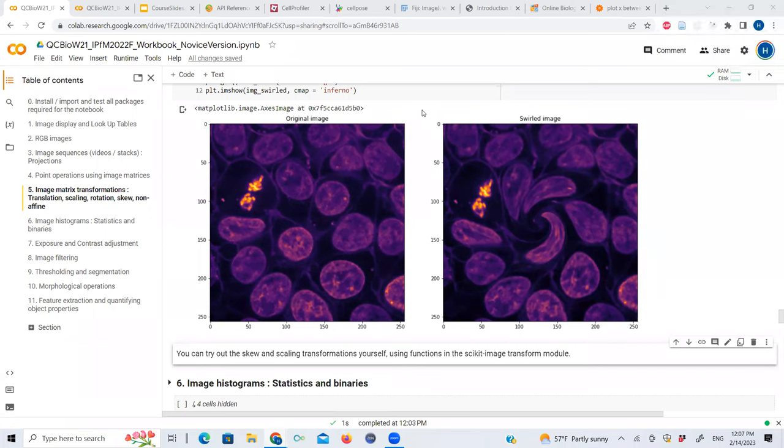Okay, for sure. Awesome. But I'm sure most of the time with image processing, it's like trial and error, just seeing what cleans up the best, right? It is a certain extent of trial and error, you're right. But there's also a little bit of method to the trial and error. That's one of the things we'll go into tomorrow: when do you try what? There are some images where it's better to apply certain filters and total rubbish to apply certain other filters. I'm going to go through those kinds of cases tomorrow.